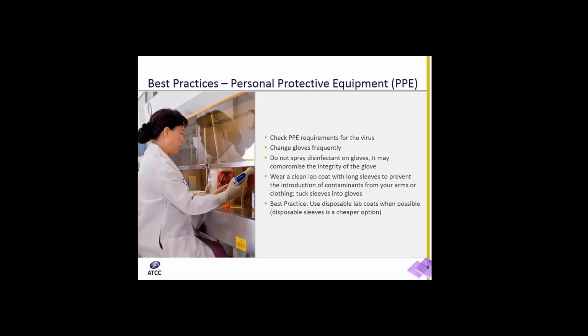Personal protective equipment. The best practice is first to check what PPE requirements are needed for the virus that you're working on. We also recommend changing gloves frequently while working inside the biosafety cabinet. When you're working, always wear a clean lab coat with long sleeves to prevent the introduction of contaminants from your arms or your clothing, and tuck the sleeves into the gloves as shown over here in this image.